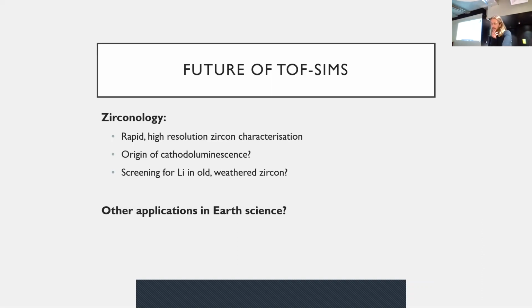I think the way we were going to try and get around it was being incredibly careful in sample prep and polishing to the finest degree. But also there's a technique, I can't remember what it's called, where you use an ion mill: you put it in a machine and it uses an ion beam to polish it essentially. So I think that might be a way to get really flat surfaces. But I guess that's still going to destroy your teeth. Yeah, but if you do it once, you should put it back together. That's true. That's true.